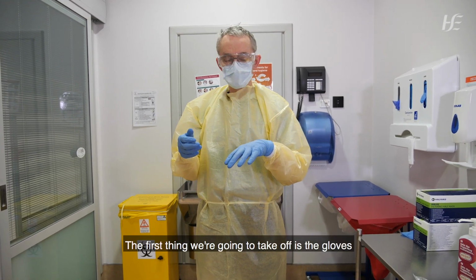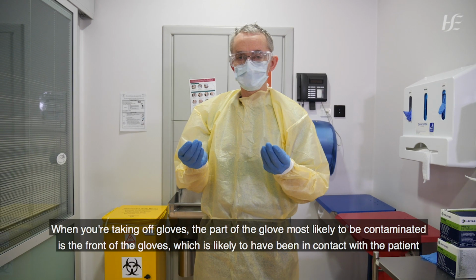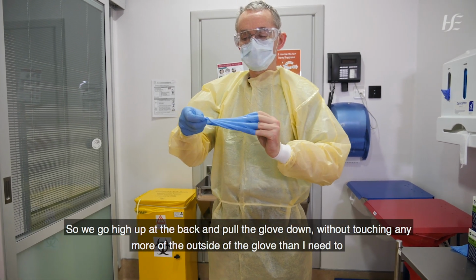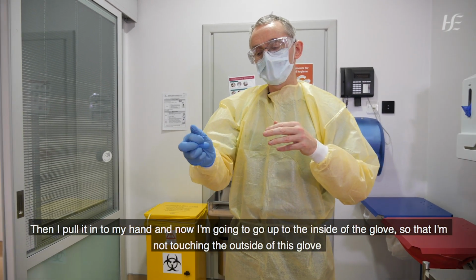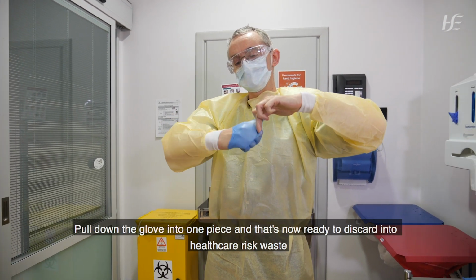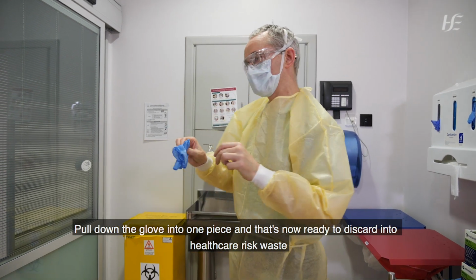Okay, so the first thing we're going to take off is the gloves. When you're taking off gloves, the part of the glove most likely to be contaminated is the front of the gloves, which is likely to be in contact with the patient. So we go high up at the back and pull the glove down without touching any more of the outside of the glove than I need to. Then I pull it in to my hand, and now I'm going to go to the inside of the glove so that I'm not touching the outside of this glove. I pull down the glove into one piece, and that's now ready to discard into healthcare risk waste.